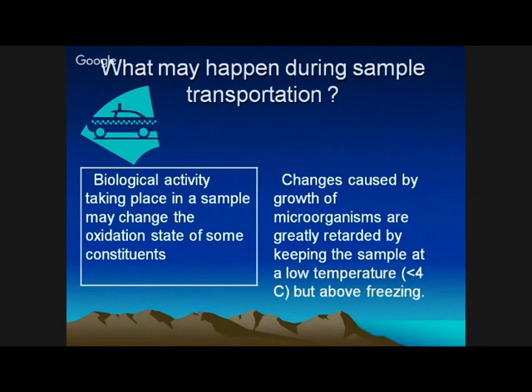Biological activity means bacteriological activity in the water. If you have collected a sample of domestic effluent from the field, there are bacteria in that sample. Bacterial activity goes on, and you have to preserve that sample below 4 degrees. You have to refrigerate that sample immediately as soon as it reaches the laboratory.